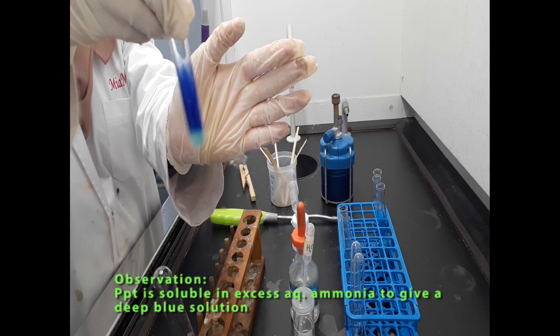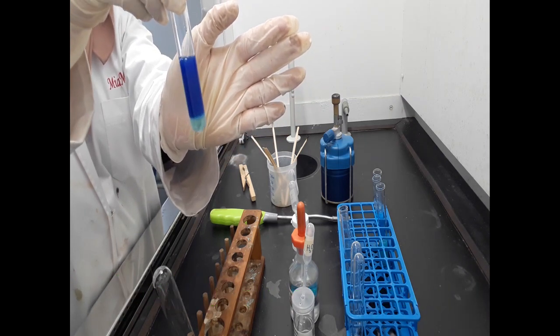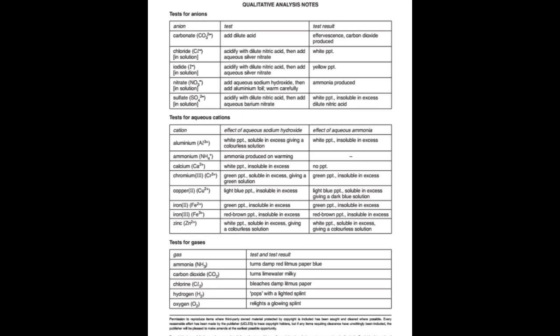Blue precipitate is soluble in excess, giving a dark blue solution. So, when aqueous ammonia was added to the solution S, it gives blue precipitate that is soluble in excess, giving a dark blue solution. Therefore, by referring to the qualitative analysis notes, the cation is copper 2 ions.